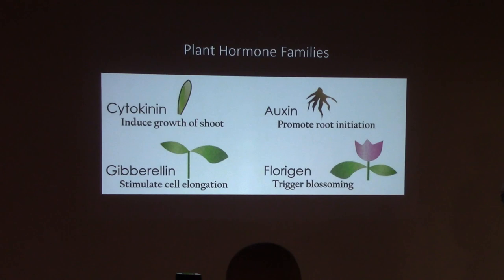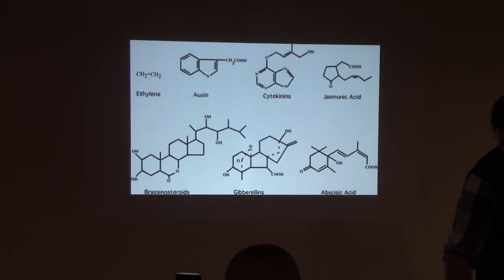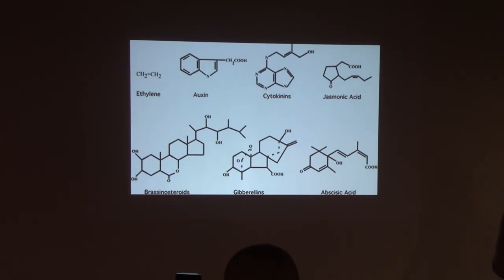So if you ever have tissue cultures that are really stubborn and they just make leaves, but you need a stem, which I'll explain later why you need a stem, this hormone's really awesome. You just add it and it will stretch out the stem significantly. So it does something super interesting, which I think you guys might enjoy. For chemists, this is how some of these families look.